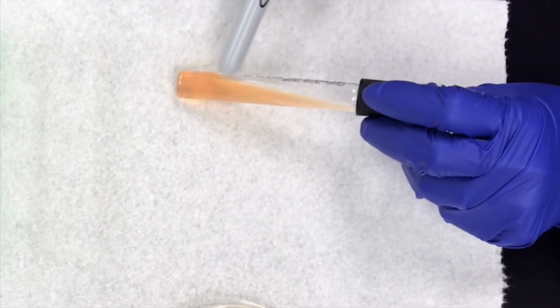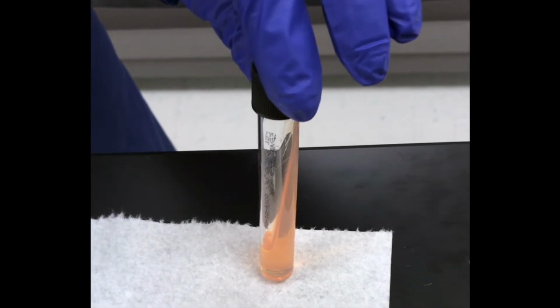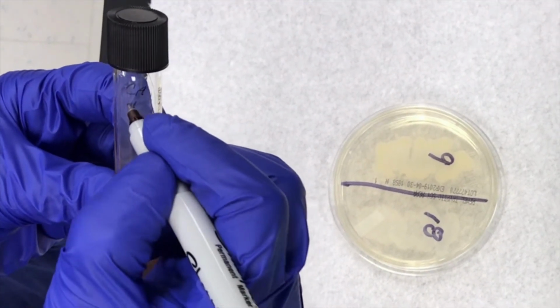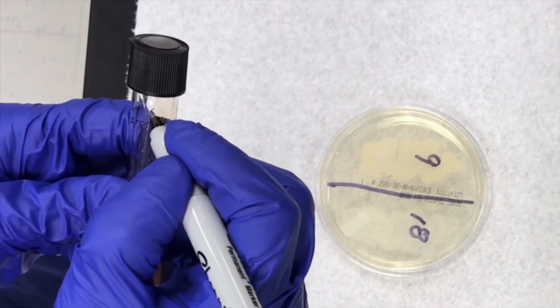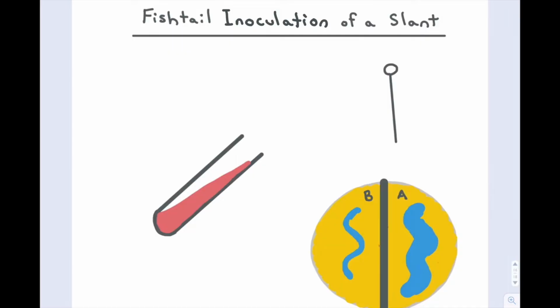And you can spread microbes on these agar slants. Notice in person, this is what it would look like. Even when it stands up, the slant remains because it's hardened that way. And when you deal with these test tubes, you want to label them at the very top, far away from the slant itself. Make sure you put your initials, the number that tells you which microbe you're dealing with, and the date that you inoculated this slant, that you spread bacteria on it.